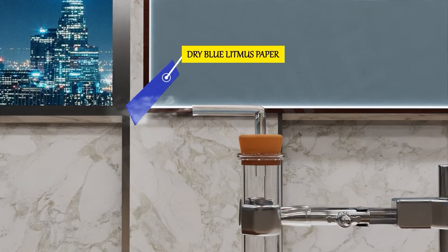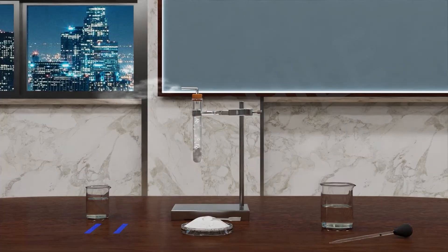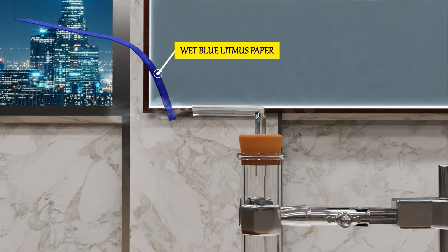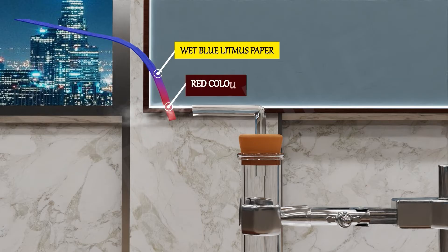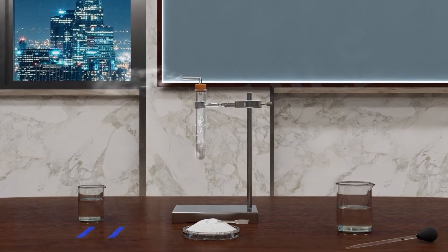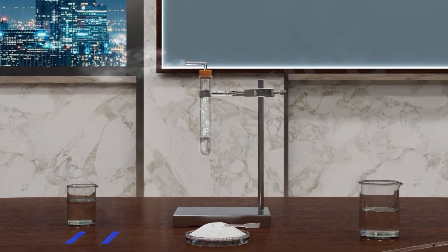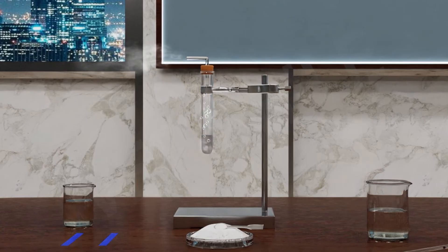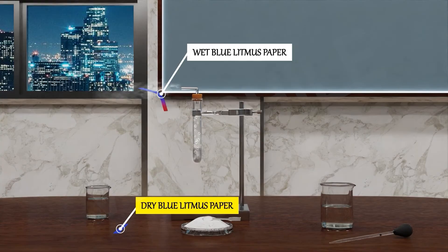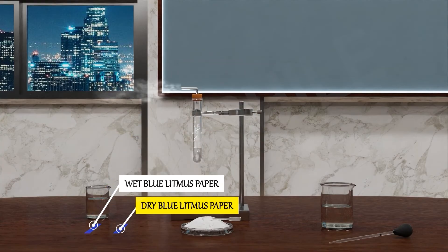That's why the wet blue litmus paper's color changes, but the dry one doesn't change.